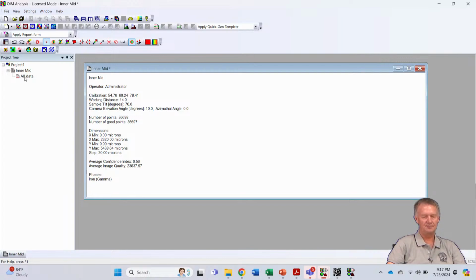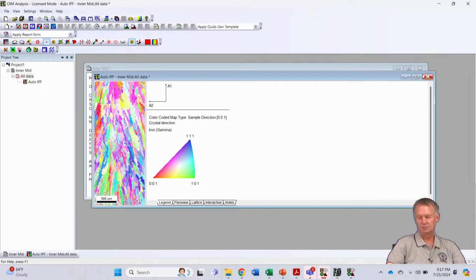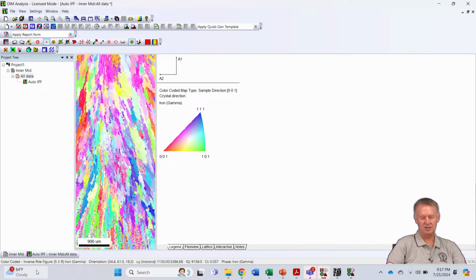up through the middle. If we look at the orientation map, it looks like this. You can see the scale bar is very big. Okay, and I want to analyze what's going on here. As soon as you get this speckled, that means it's probably some bad data, right? So we have a little bit of bad data that's speckled in it. And that's because it's such a big map.